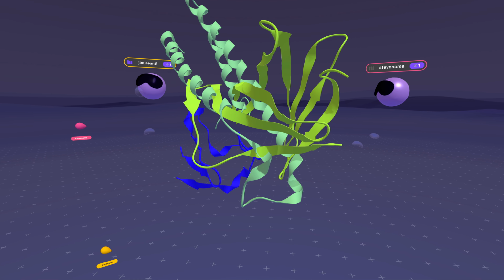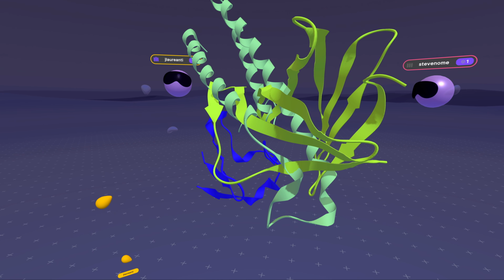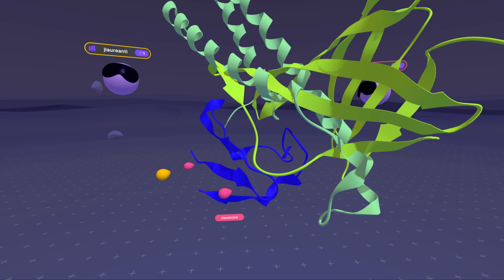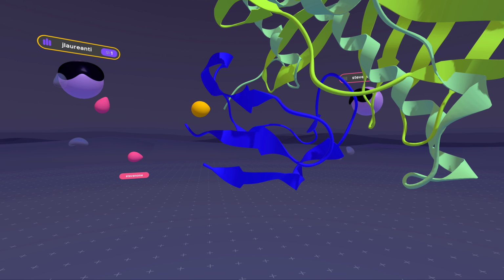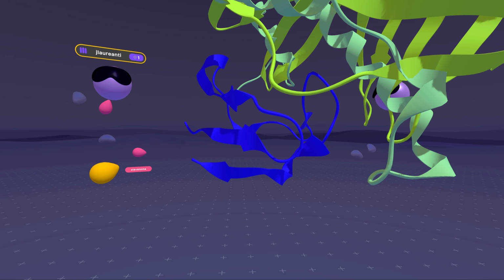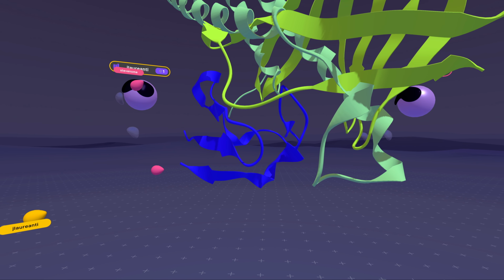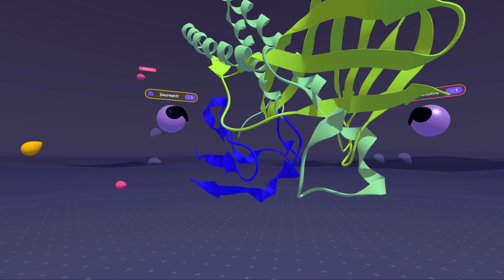Yeah. So I actually used a different tool in Mara that I forgot to talk about earlier, but you can see that in blue down here, we have the target protein. What I did was use a tool in Mara that aligned chain B, since the target was chain B in each binding file. That way, when we loaded these into the same space, we can really easily see what components each binder is interacting with.